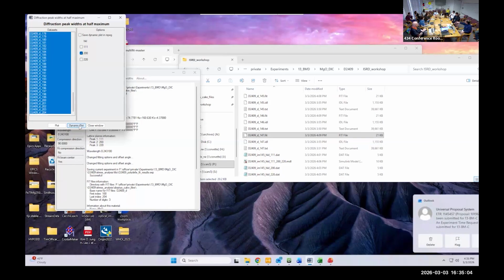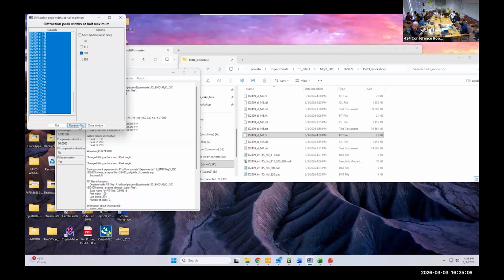If we can also open up the DDIA and you can see, because it's down at room pressure. Grace and Bailey, I think, are taking a nap so they can stay awake all night. So if you would like to see that as well, we can pull that out. Okay, if you want to do that.